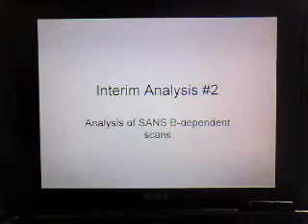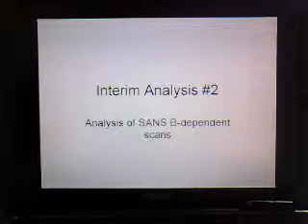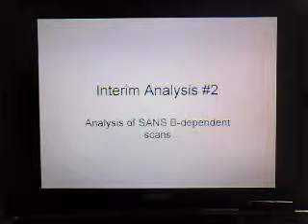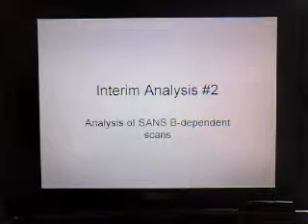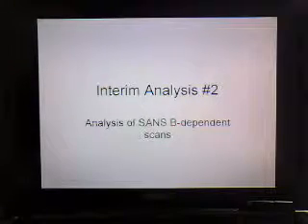So this is my second report on analysis of the SANS data that we took at NIST. These data are the data taken as a function of applied field, and so this was taken with the rather intermediate detector setting. The data don't reach to a small Q as we need, but we do still see some of the small Q behavior and also the medium Q behavior that I discussed last time.